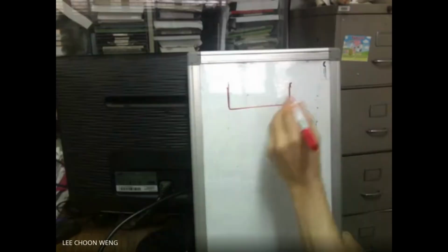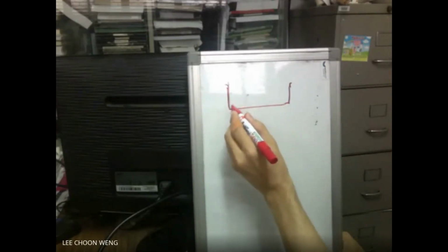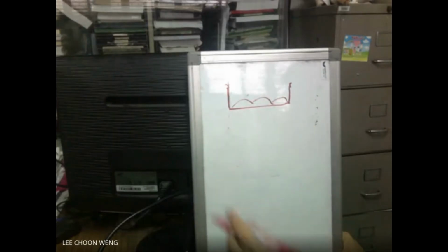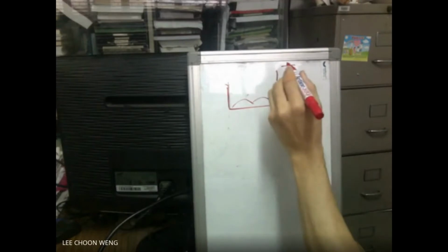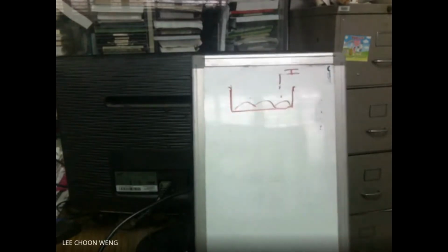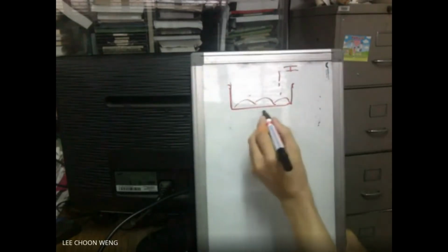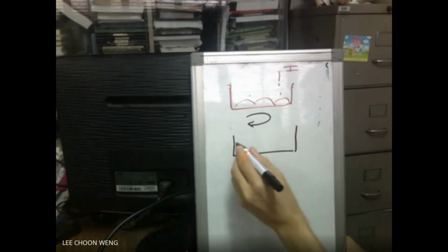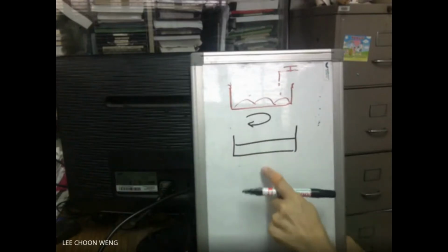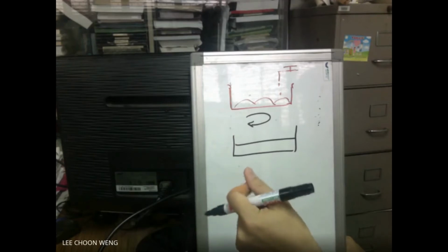So usually you have a tray here, then we'll put the mud in the plastic tray. We add water from the tap and mix it well to create a slurry. Okay, so this is an important step. A slurry means it's muddy, it's liquid-like.